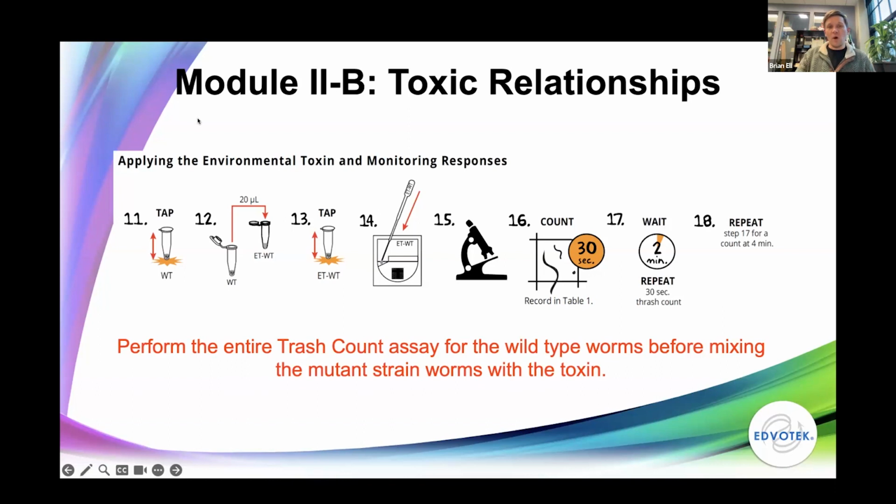The next part we want to do one at a time. So we have our worms collected, our wild type and our mutant strain. They're fine hanging out in this S-buffer for half an hour, even longer if we need to. So don't worry about moving on to this step immediately. It's better to do things accurately than to go really quick through these next steps.